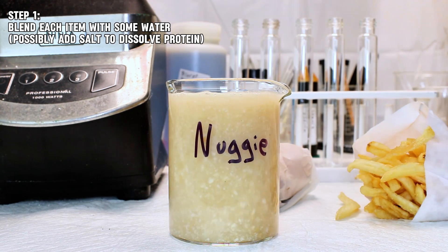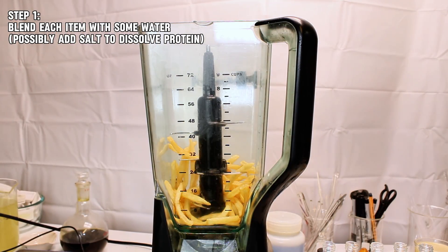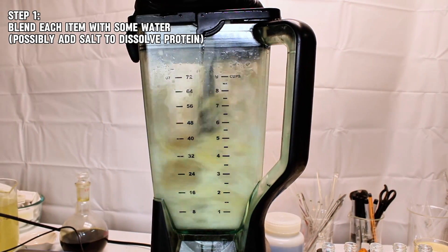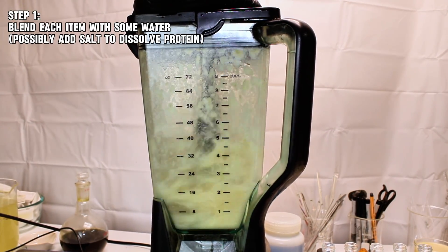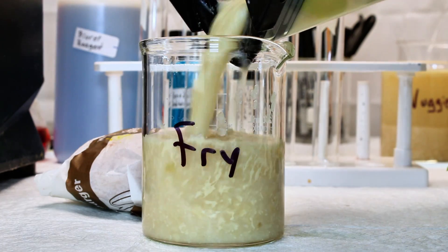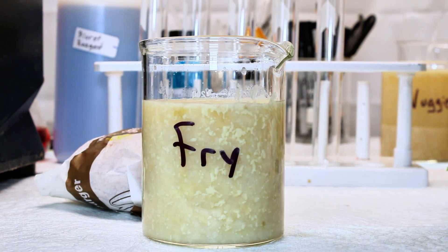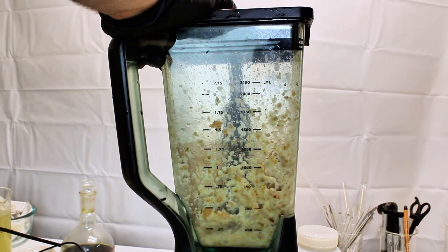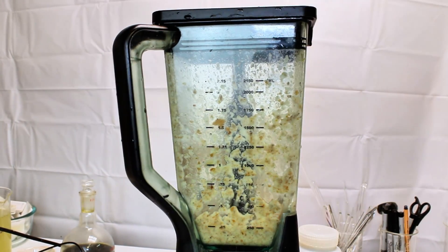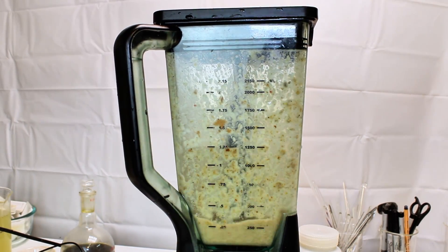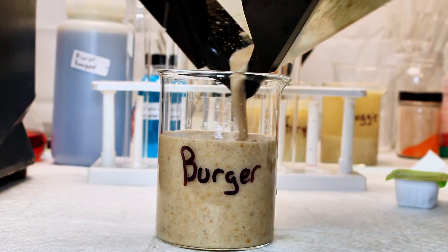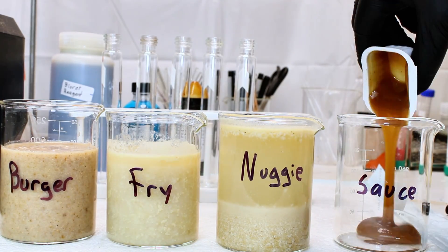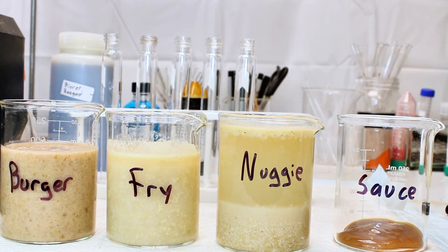I started with the chicken nuggets, to which I added a bit of sodium chloride to help salt in some of the protein, which is a step I skipped when I blended the burger, as I figured they both already probably contained enough salt to suspend a somewhat decent amount of protein. Skipping this step for the burger though might have been a bad idea, and I'm not actually sure. Also, I didn't bother blending the dipping sauce, and instead I just diluted it with some distilled water. In any case, once all the food items had been thoroughly blended and transferred to a few beakers, I decided to start with the Lugol's test for starch.